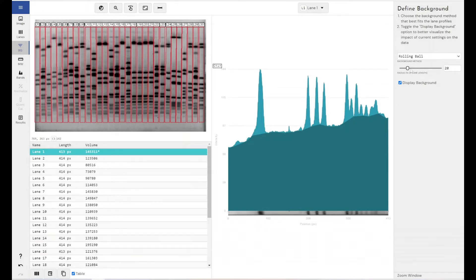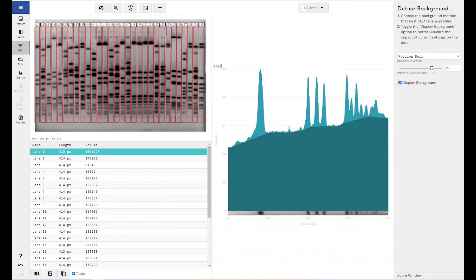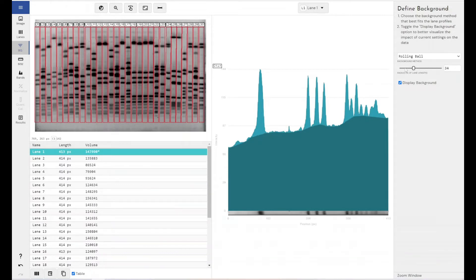And the ball, the smaller you make the ball, the further it will fall into your peaks. So imagine it rolling up. And the larger you make your ball, the fewer peaks it can fall into or the larger the peak would need to be for it to fall into it. So this gives it a certain level of adaptability to the changing background within your lane.